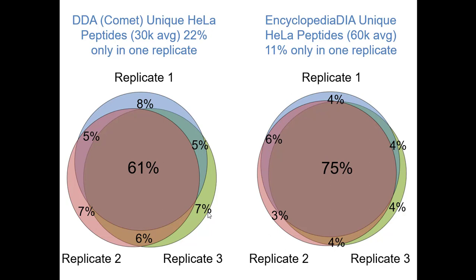That's definitely one concern. False discovery is definitely one concern. I think the biggest thing is that for a lot of the low abundant ions, you're basically telling the instrument to pick what it thinks it wants to measure at any given time, right? And it's going to make a different decision every time because it has no knowledge of the previous acquisition. It has no knowledge of anything that's happened before. It's just making that decision on the fly. Should I measure this particular peptide?